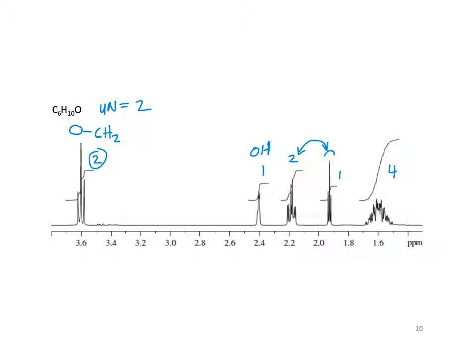It possibly could, but we just don't know what's in there. And what about these four protons? This is probably CH2, CH2, coupling with each other, so it's very second order in there, and they also couple out to other things on each side.